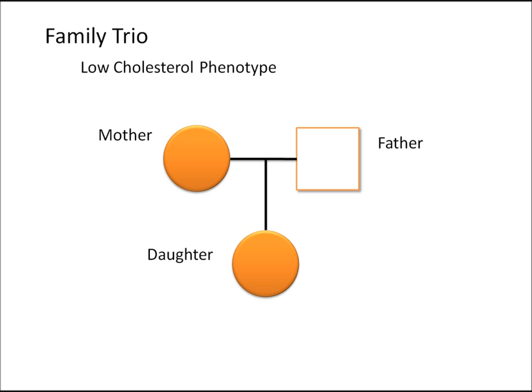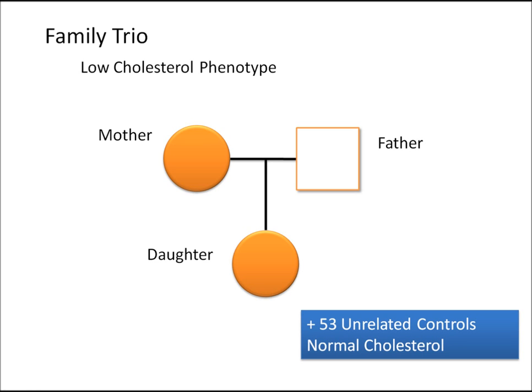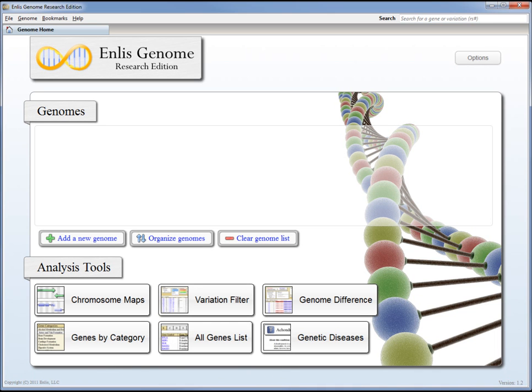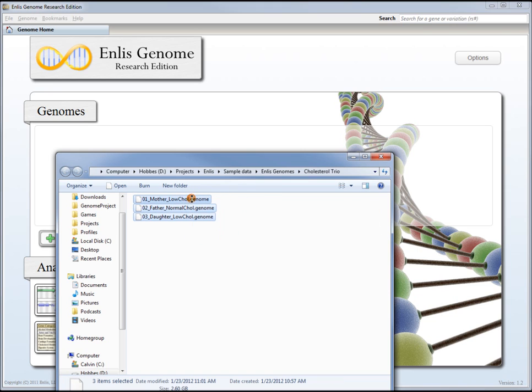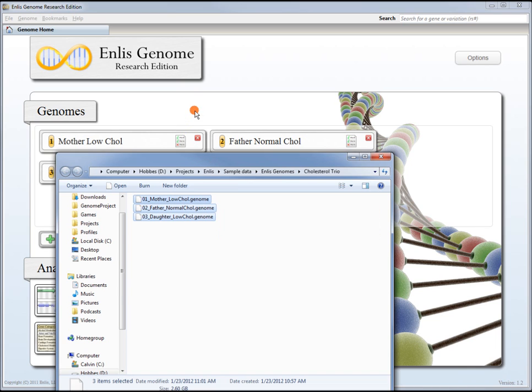In addition to the father, we also have 53 unrelated controls who also have normal cholesterol levels. Here we are at the main Enlis.Genome research application window. We don't currently have any genomes loaded, but we can do that very easily. We've already imported the mother, the father, and the daughter's genomes, so we can simply drag and drop those onto the window.